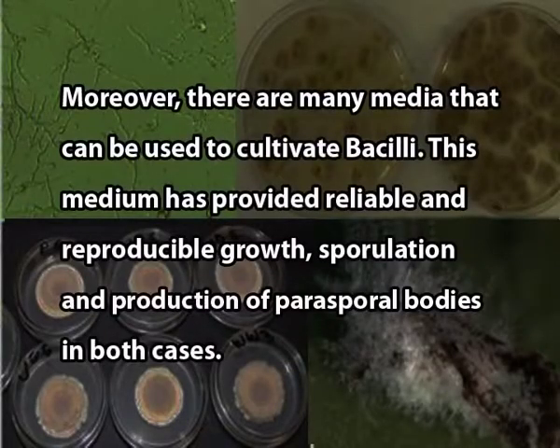Amino acids are the preferred nitrogen source for other Bacillus species, which also require the vitamins biotin and thiamine to grow and calcium and manganese ions for sporulation. Moreover, there are many media that can be used to cultivate bacilli.